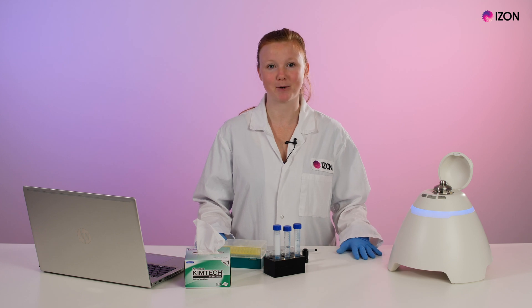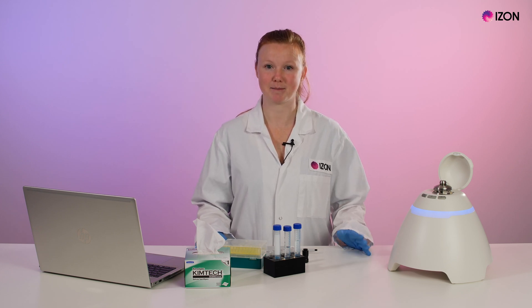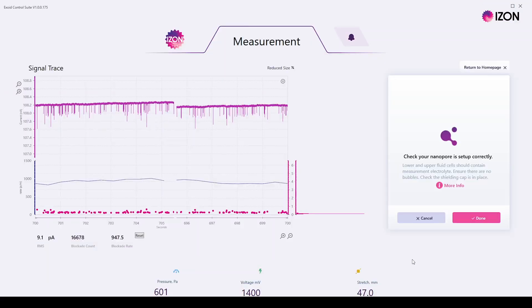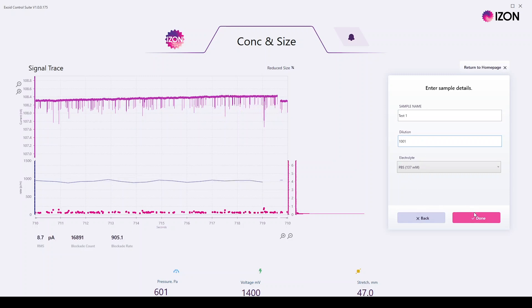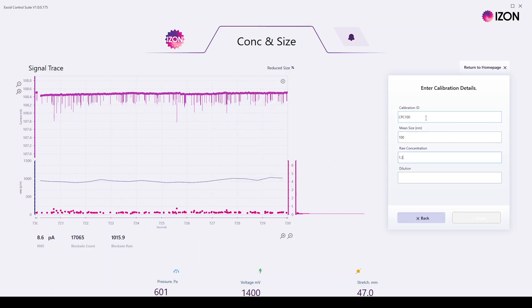Today we're using an Exoid and an MP100 nanopore. It has already been wetted and is ready to be calibrated with CPC100s. Following nanopore setup, we have loaded the upper fluid with CPC100 particles and the average blockade size is roughly 0.2 nanoamps at a baseline of 108 nanoamps. This is at a voltage of 1400 millivolts, 600 pascals pressure, and 47 millimetre stretch.